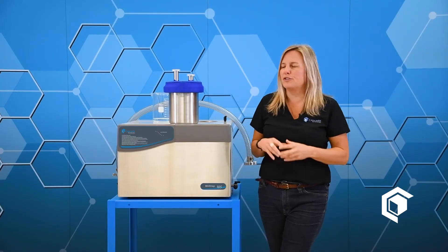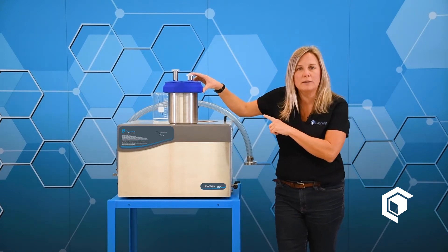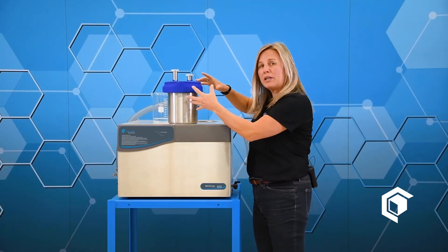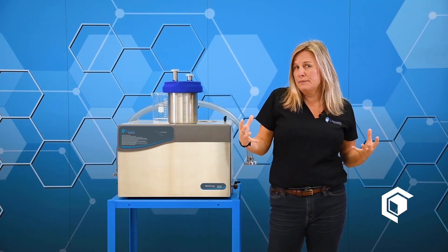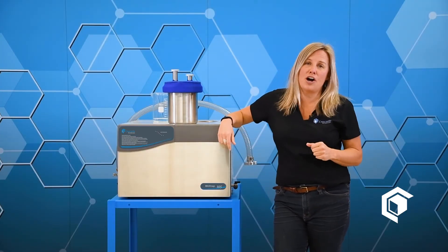We're happy to tailor those hoses and connections to your specific process. Here is a pro tip about the cold well: have a spare. This max trap trapping system is designed for high throughput, high production environments. Should the cold well become full or frozen, just pop it out, set it aside to defrost, drop in a fresh one, and keep right on going.